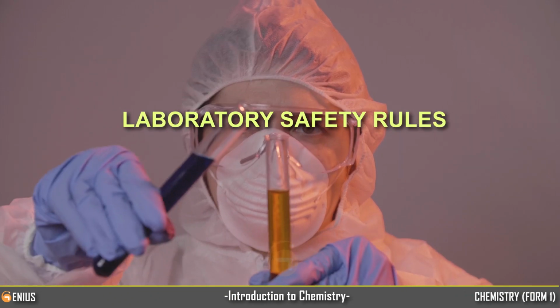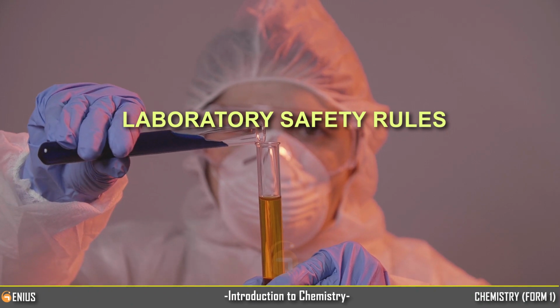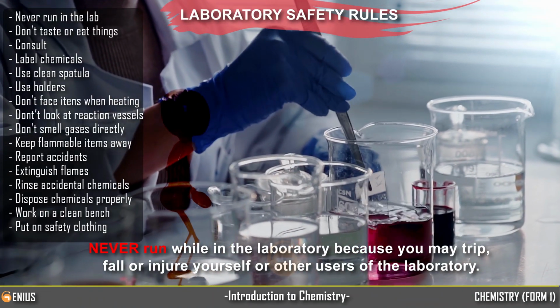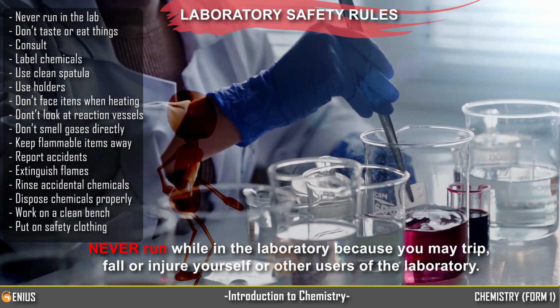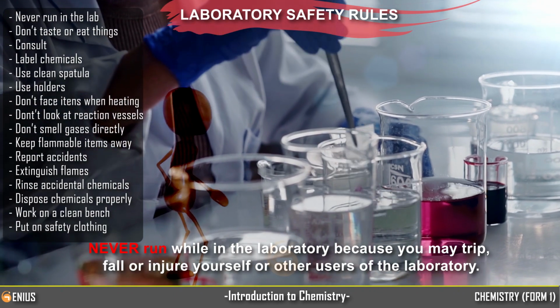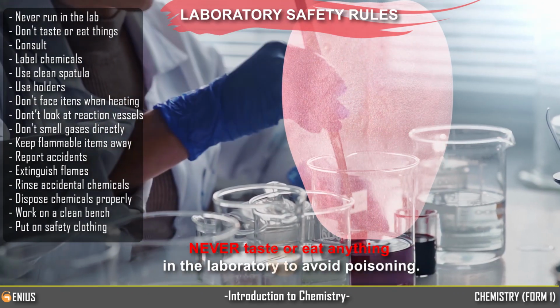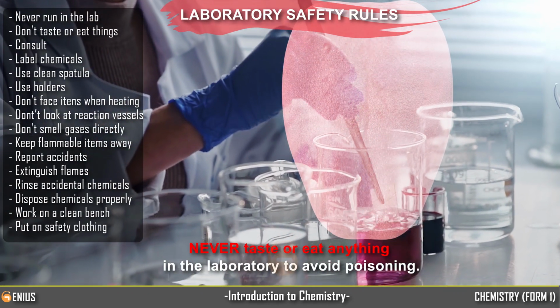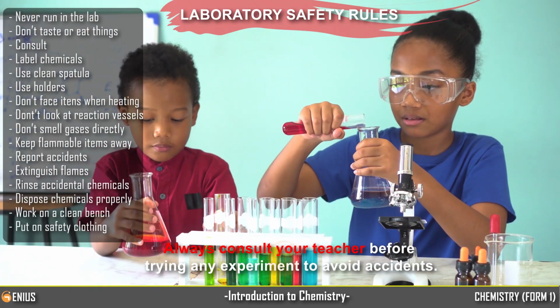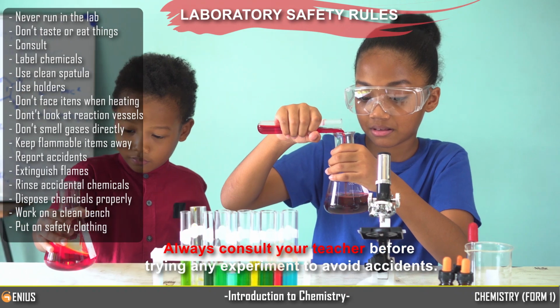Laboratory safety rules. Never run while in the laboratory because you may trip, fall or injure yourself or other users of the laboratory. Never taste or eat anything in the laboratory to avoid poisoning. Always consult your teacher before trying any experiment to avoid accidents.